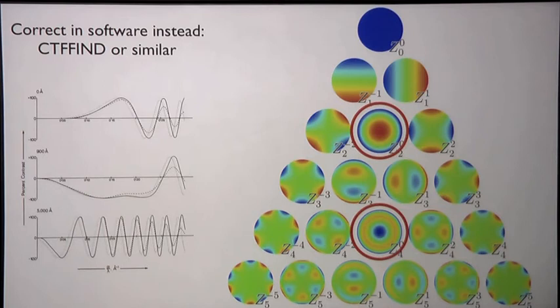There's another little detail that I'll just mention in passing, but actually we take advantage of spherical aberration because of the difference between these two. This is the defocus, this is the spherical aberration. What I haven't told you is that spherical aberration is constant for a lens. It's a property just of the geometry of this thing and how it was built. So it doesn't change with the current to good approximation.